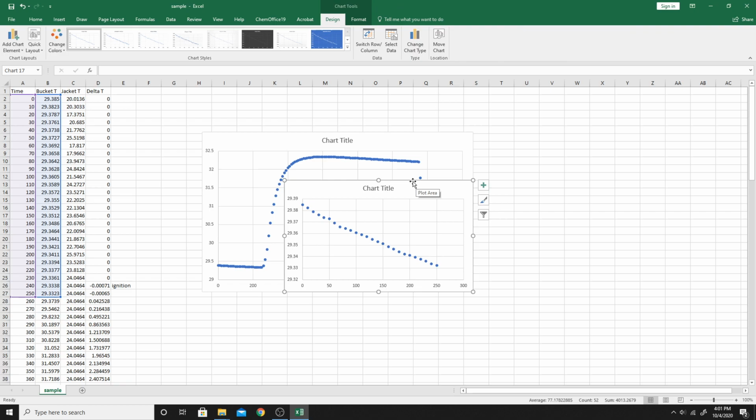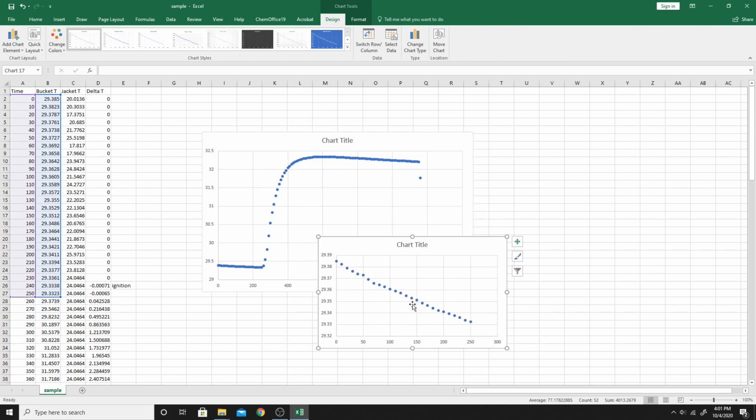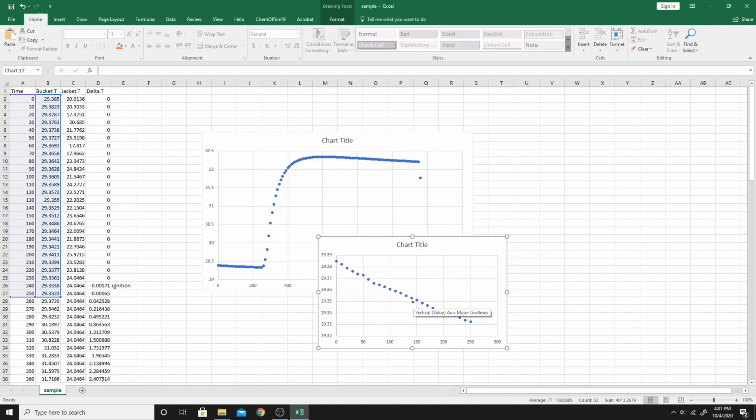And you can see this looks different from stage 1. So this is stage 1, this is the same data. Even though they look different, they are the same, it's just a different range. The important thing we need to see is whether this is a straight line. In other words, is the temperature stabilized?